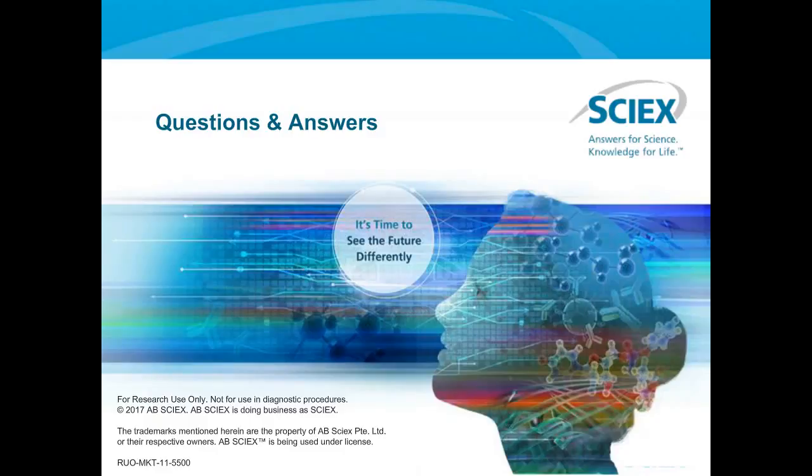Factor is, it depends on the glycosylation extent of the glycoprotein itself. So there is no straight answer for that one, because the IgG molecule itself, for example, contains 2% glycosylation. The EPO contains 40% glycosylation, so it means that you have to start with a completely different amount of those samples to be sure that you have enough glycans.